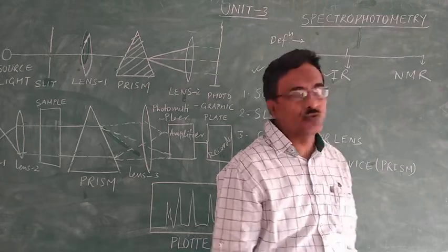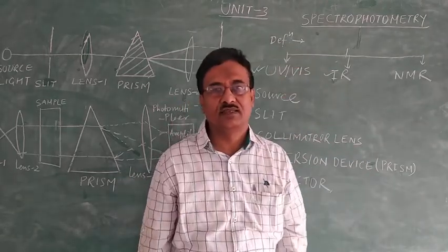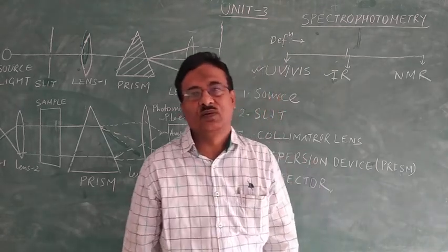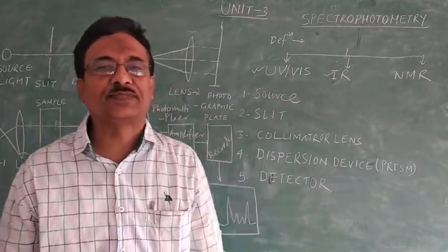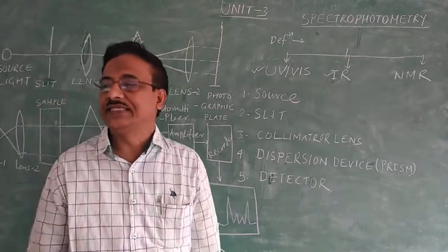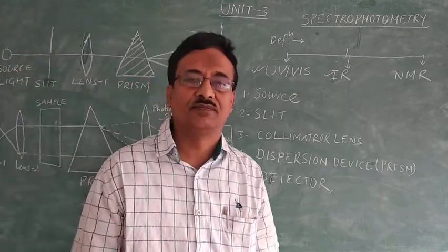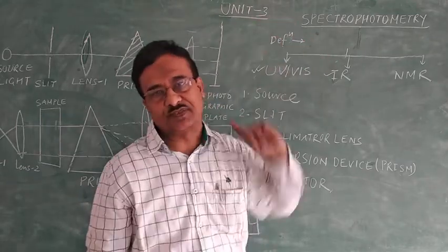What is spectrophotometry? Can you explain the definition of spectrophotometry? Anybody? No. Okay. Today I discuss the definition of spectrophotometry. It is an instrument which is used for producing any kind of spectrum, maybe emission spectrum or maybe absorption spectra.